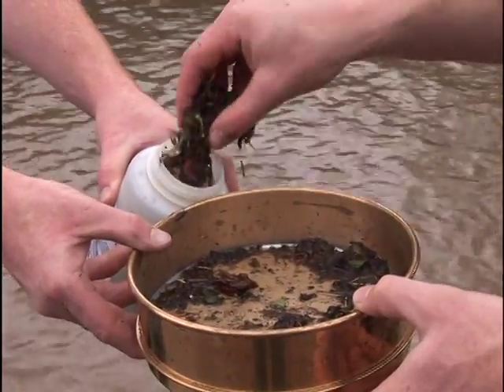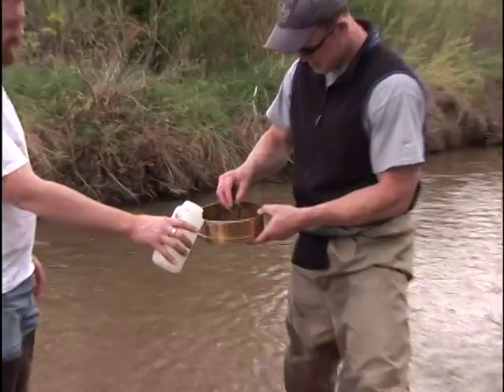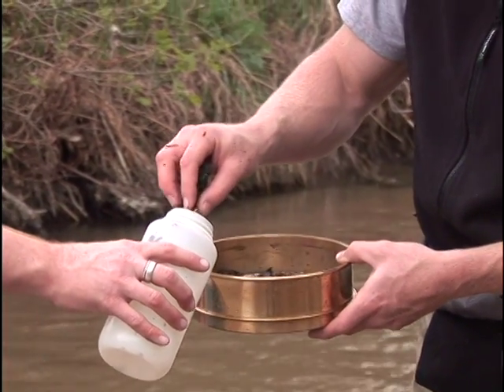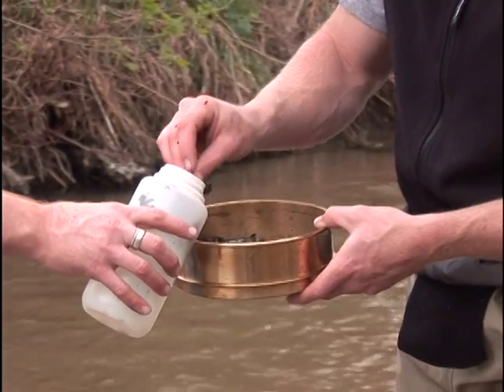A specialist will later separate the bugs from the debris during analysis. Do not attempt to pick the bugs yourself. Just place all the organic material into the sample jar.